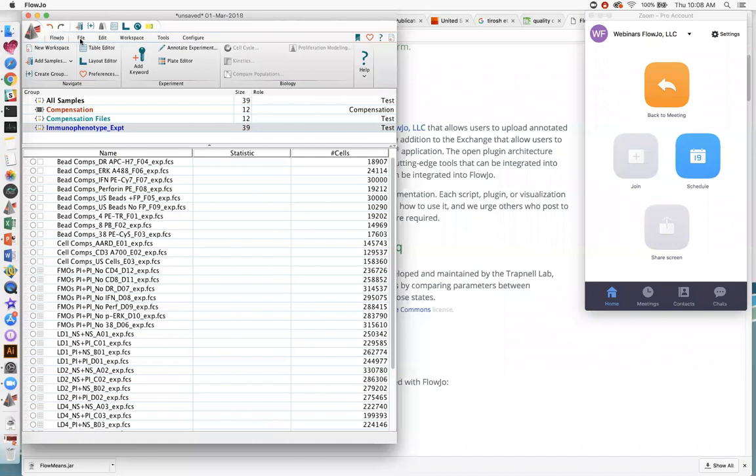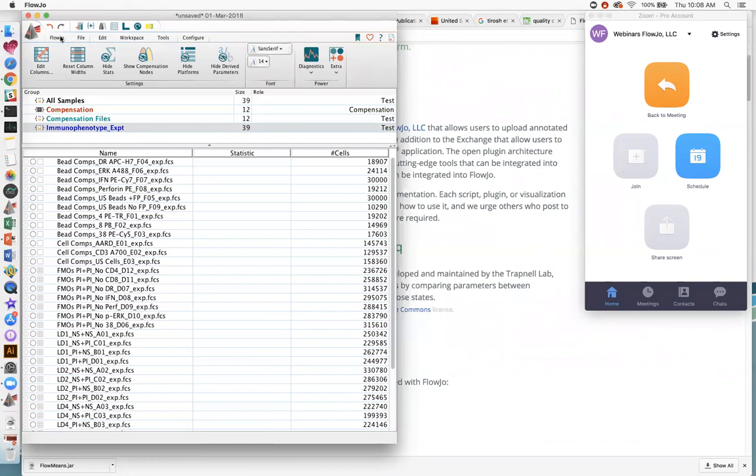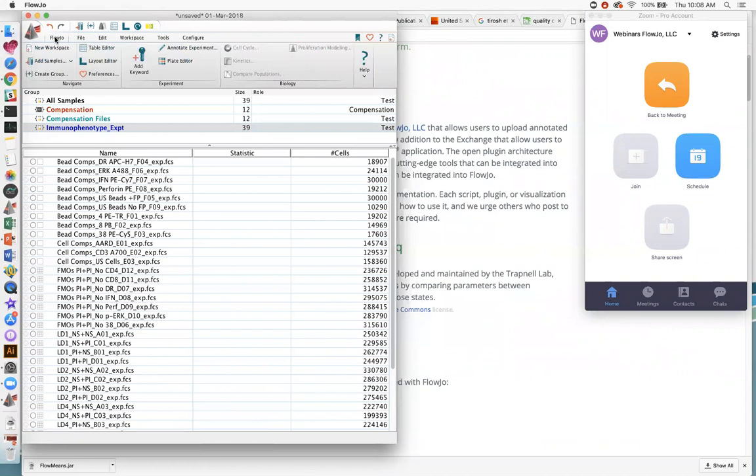Down below these major task bars is the ribbon that exists in FlowJo. You can see when I click on these tabs, the ribbon underneath changes. I'm not going to explain all of the different bands today, but the general idea is that if you're looking for certain functions, they're generally subdivided by the different types of tabs. I'm going to show you where all the major functions are. Again, try to get your work done as fast as possible so that you do the least amount of clicking. I'll talk about those as we do the analysis.